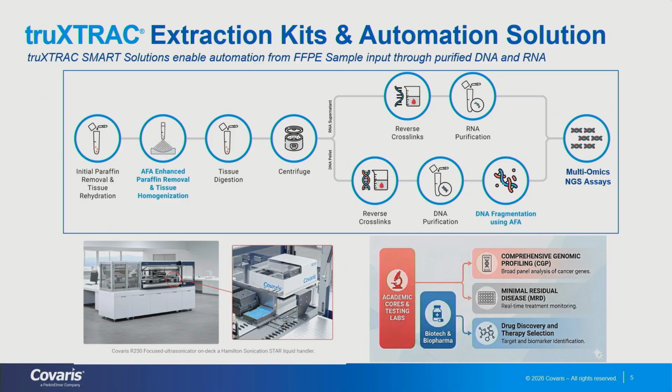And by that, we can facilitate the proteinase K treatment downstream. We spin down the sample, which makes the DNA end up in the pellet and the RNA in the supernatant. And by purification of both these fractions, we have DNA and RNA from the same sample, which can be used for further downstream processing. And the quality is very good, both for DNA and RNA, and particularly the RNA sticks out as very high quality with a high molecular weight RNA.